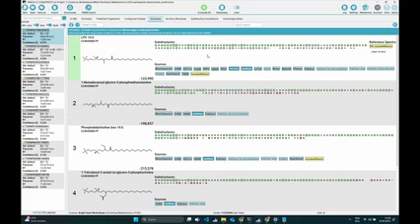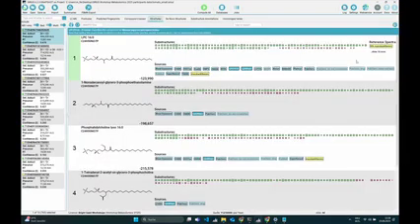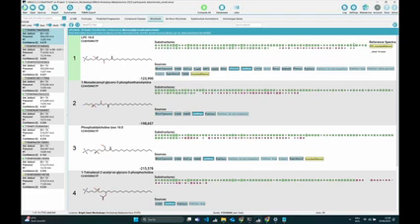The only thing we ensure is, since CSI FingerID needs to know the formula beforehand and library search does not, we do the library search to ensure that no hit gets lost before ranking. Then we rank everything by structures. You get a single ranked list. You do not have to merge results. On the list, we annotate that this is the top 1 structure hit, and it also has a library hit. That's how we do it.